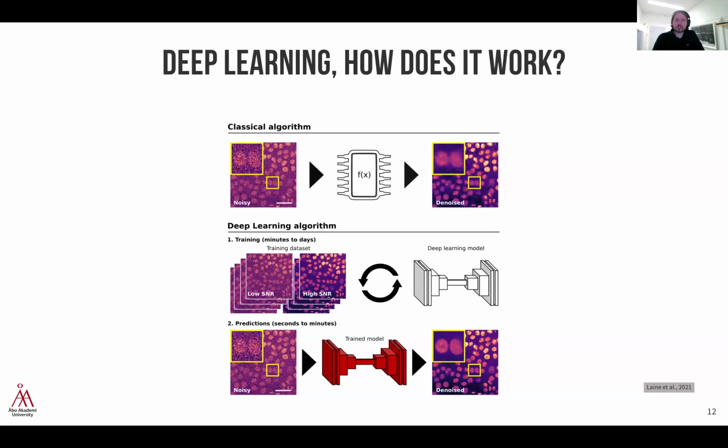But one issue that many, I would say even experimentalists, have is that you really need to have the knowledge in terms of knowing what would be the most appropriate way to denoise those images, right? You need to choose what is the best one to use.